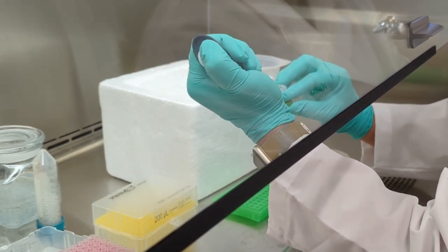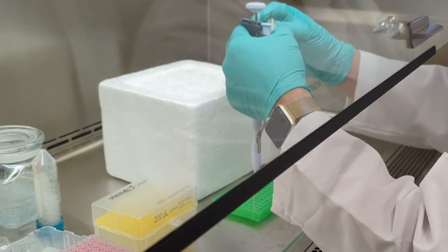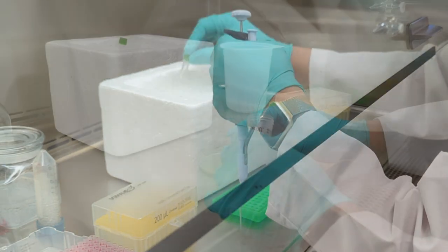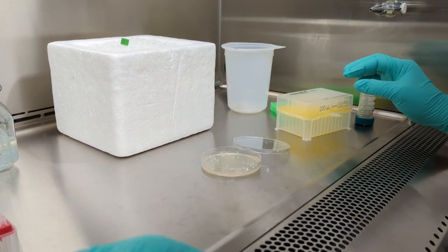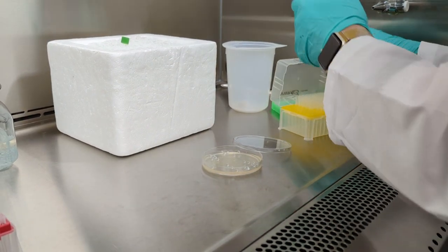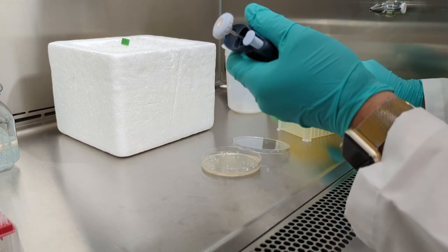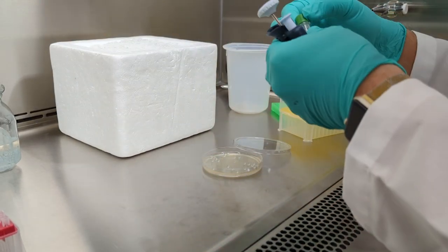Mix gently by pipetting up and down a few times, then place the mixture on ice for 3 to 10 minutes. Use a sterilized spreader or autoclaved Koli roller plating beads to spread 25 to 50 microliters from each transformation directly onto a YT plate containing 100 micrograms per mil ampicillin.